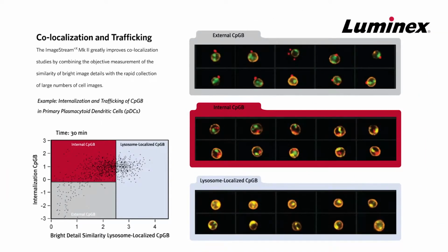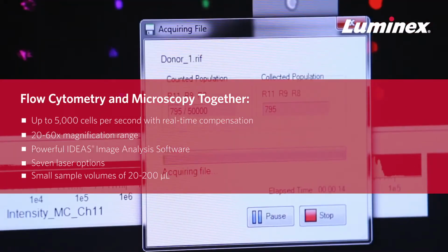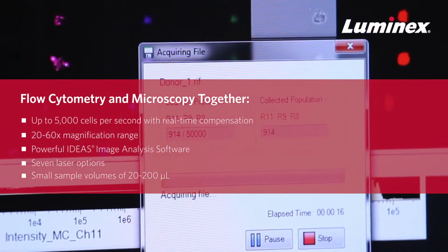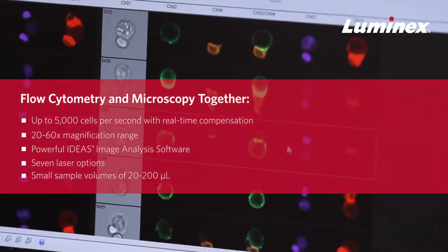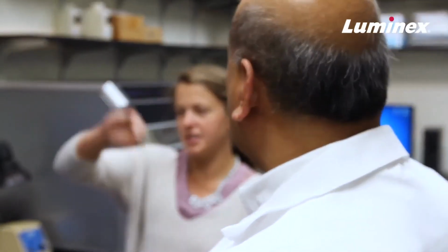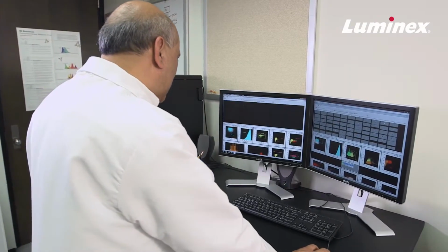What we've been limited to in the past in terms of imaging was microscopy-based technologies where you have the ability to maybe look at 100 cells or 500 cells. But if you are thinking in terms of rare events, you are thinking about 1 in 10,000 cells or 1 in 100,000 cells. With the ImageStream, we are fortunate that we can run 10,000 or 100,000 cells through. So the ability to detect the presence of these rare events is significantly improved with the ImageStream.